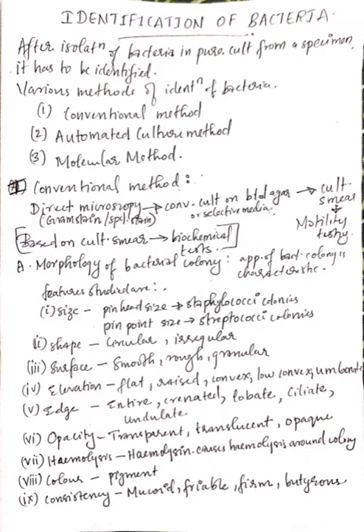Ninth one is the consistency. It could be mucoid, friable, firm or buttery.